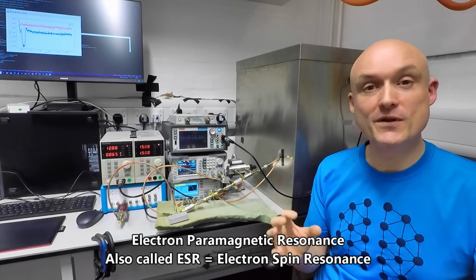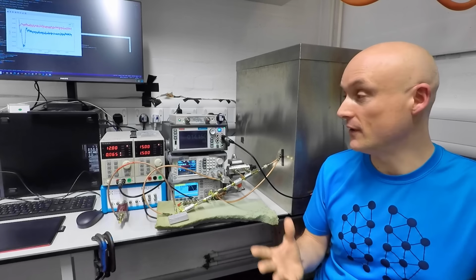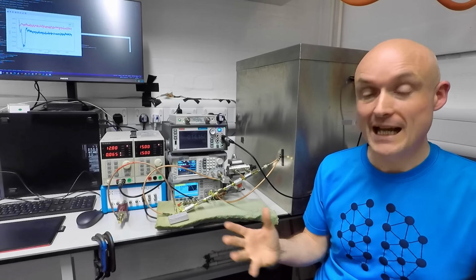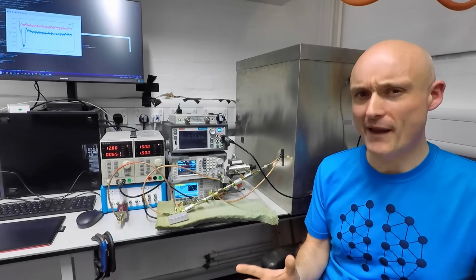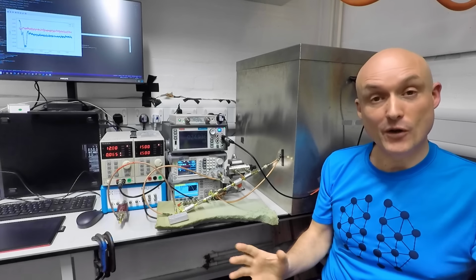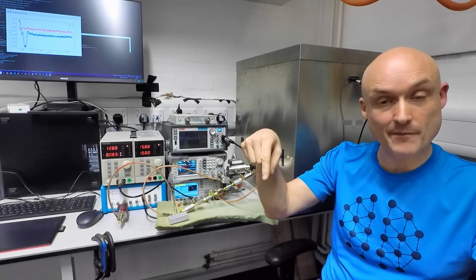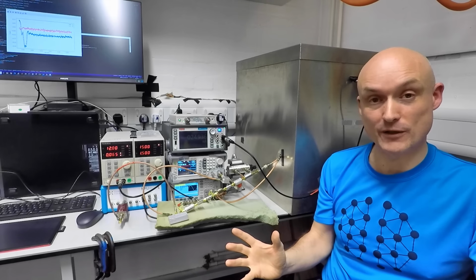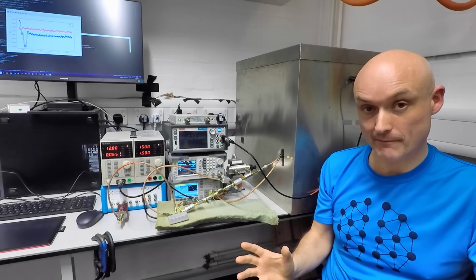dipole due to their quantum property of spin, and we can exploit that using an EPR spectrometer in order to get a resonance effect. So let me explain what that means. As you might know from quantum mechanics, an electron can either be spin up or spin down in any particular orientation, and there isn't usually an energy difference between those two levels.